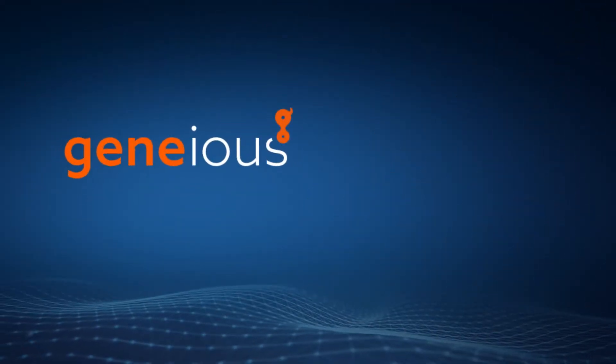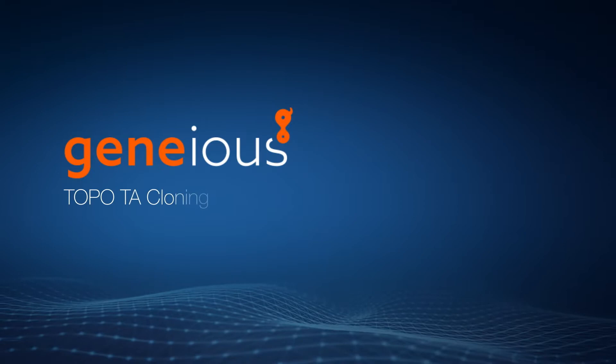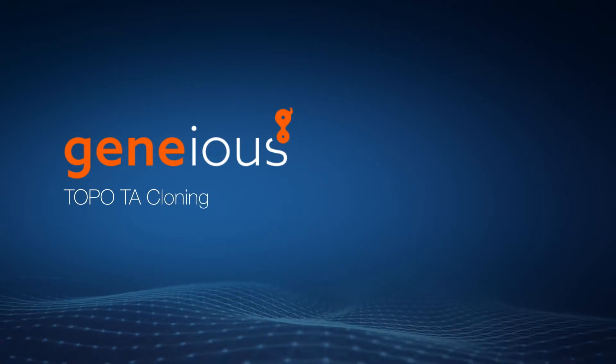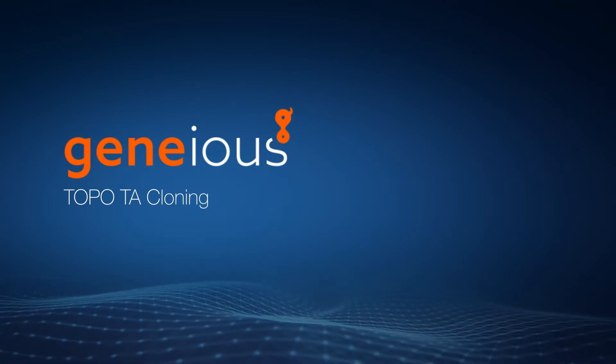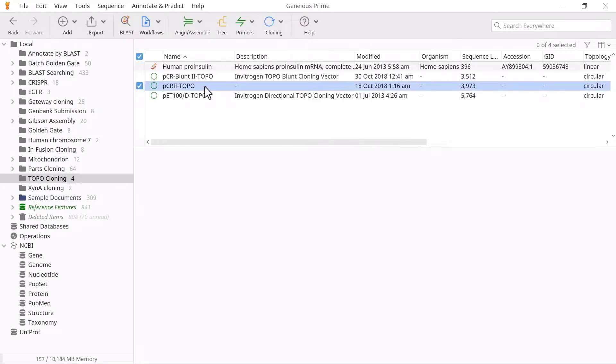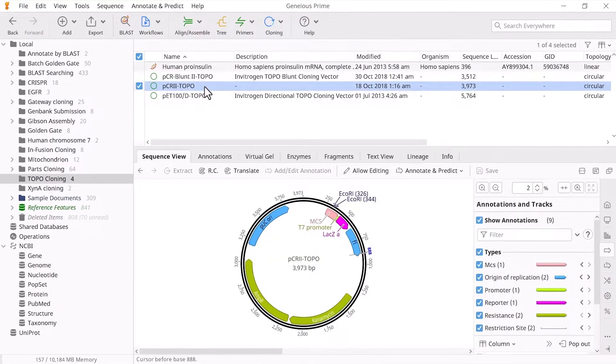Welcome to this video on performing Topo TA cloning with Genius Prime. To begin, prepare your vector and insert files for cloning.